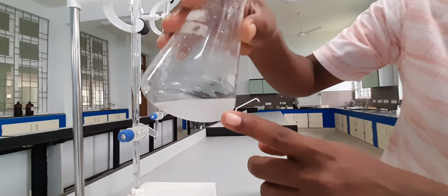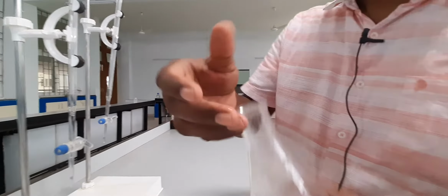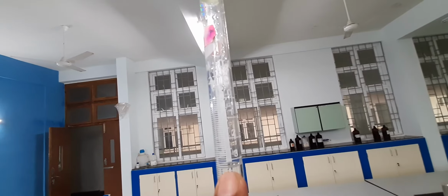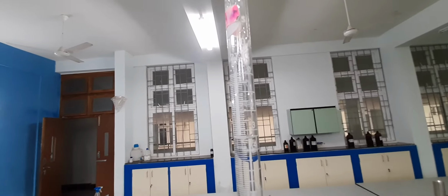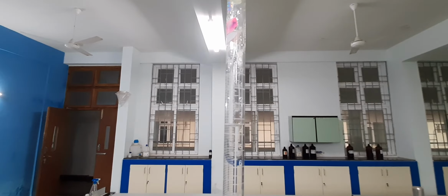Now you can see there is a haziness. So this is the point that we have to consider and record. If I look at my burette value, you can note down that this is 3, and then approximately 3.3 or 3.2 is the reading. Okay, so the water is 3.3.